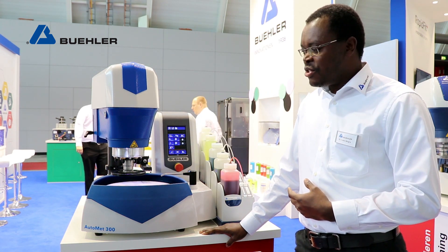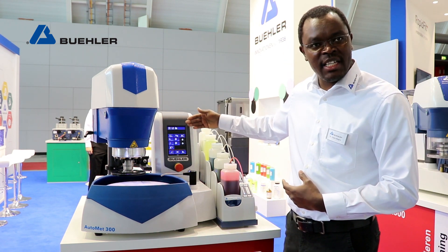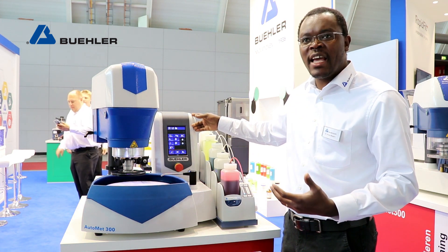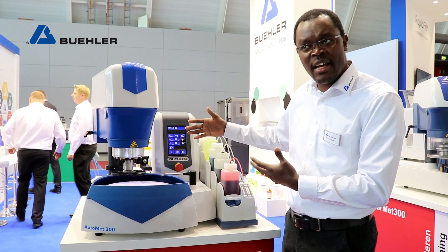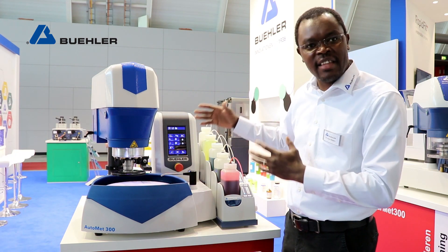A key feature we've introduced on this new machine is a better, more intuitive interface that allows you to do your preparation routine in a more effective and efficient manner. Any technician that comes in can look at the interface, do the programmability, and save the methodology without having to worry too much about whether they're getting things right.